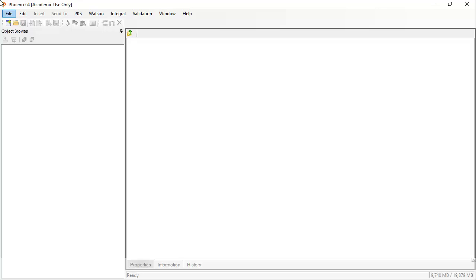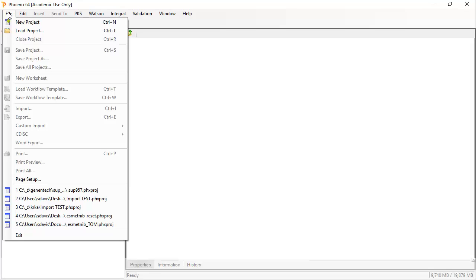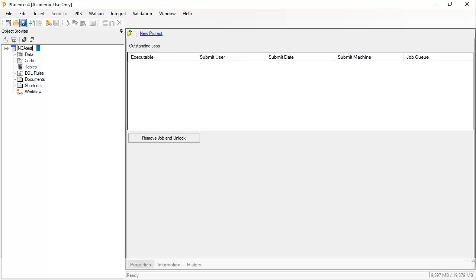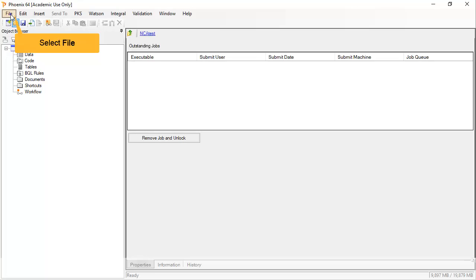When first opened, the Phoenix workspace is empty. To get started, one can either load an existing project or create a new project. To create a new project, select File > New Project. It is recommended to always rename a project. Then, to import the study data, select File > Import.